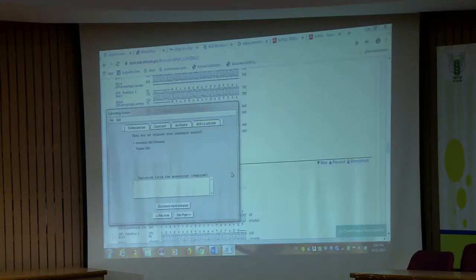Doing the PCR and sending it for sequencing is nothing, it's 2-3 hours of work only, right. But handling those sequences and getting the accession number, that actually matters. So any other confusion, any other question, please?